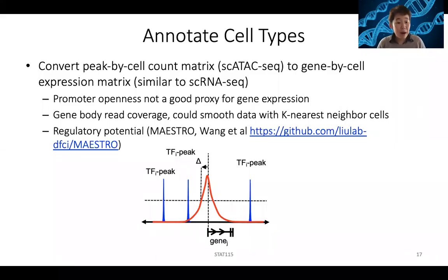So the next part is to start combining the single cell ATAC-seq with single cell RNA-seq. You probably saw a little bit in the previous slide that after we know some transcription factor with ChIP-seq that has significant overlap with your ATAC-seq peaks, you still want to check whether the transcription factor is expressed or not, which means we do care about the expression level of the genes.